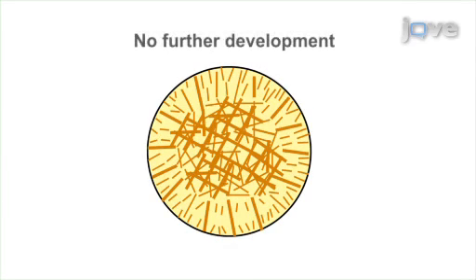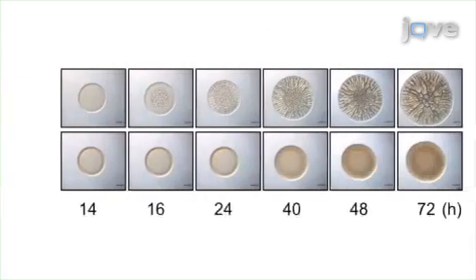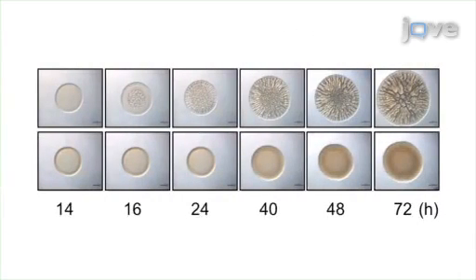Development of colony morphology is monitored until no further changes are visualized. Ultimately, microscopy of the spots is used to show differences in biofilm development over time by specific strains or under specific conditions in a manner that is semi-quantitative.